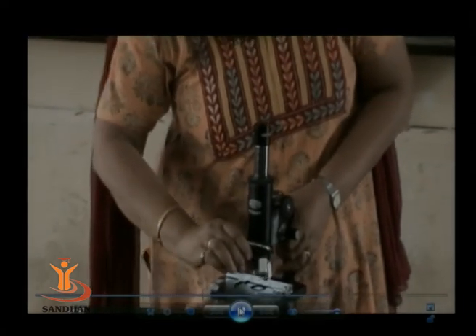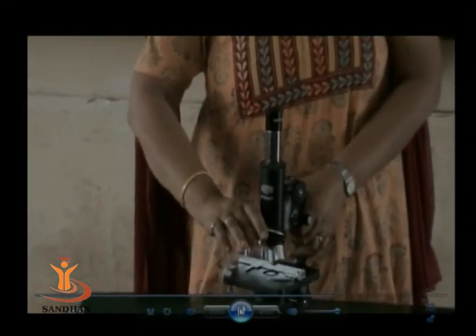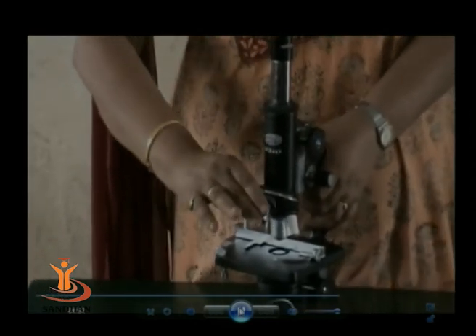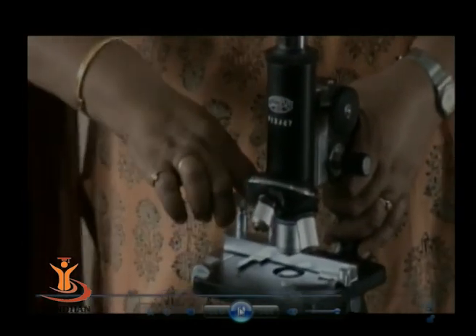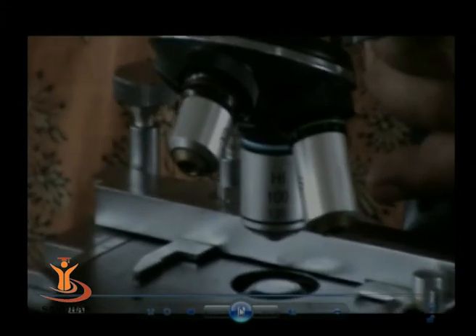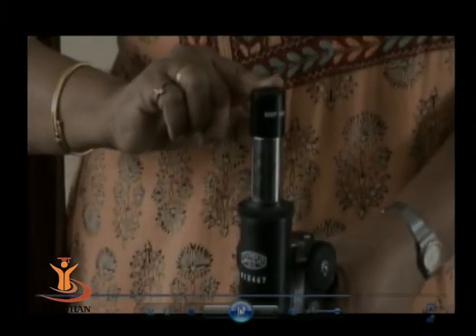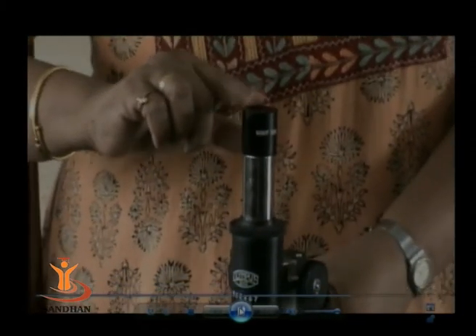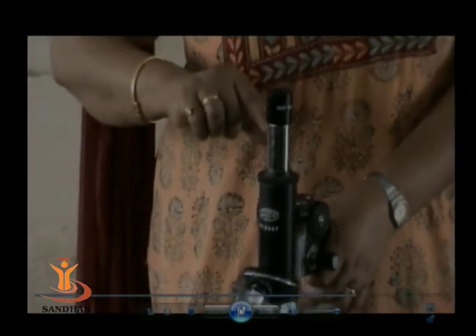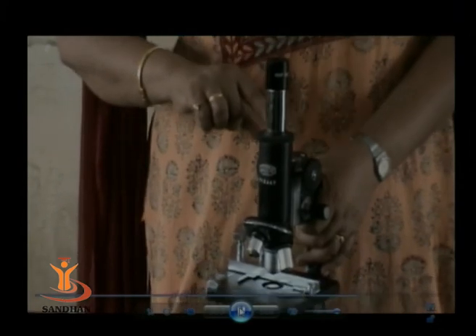For example, while using the oil immersion lens, which is used in the routine examination of bacteria, the magnification power of the objective lens is 100x and that of the eyepiece, or the ocular lens, is 10x, so the total magnification would be 100 into 10. So the total magnification achieved is 1000x.